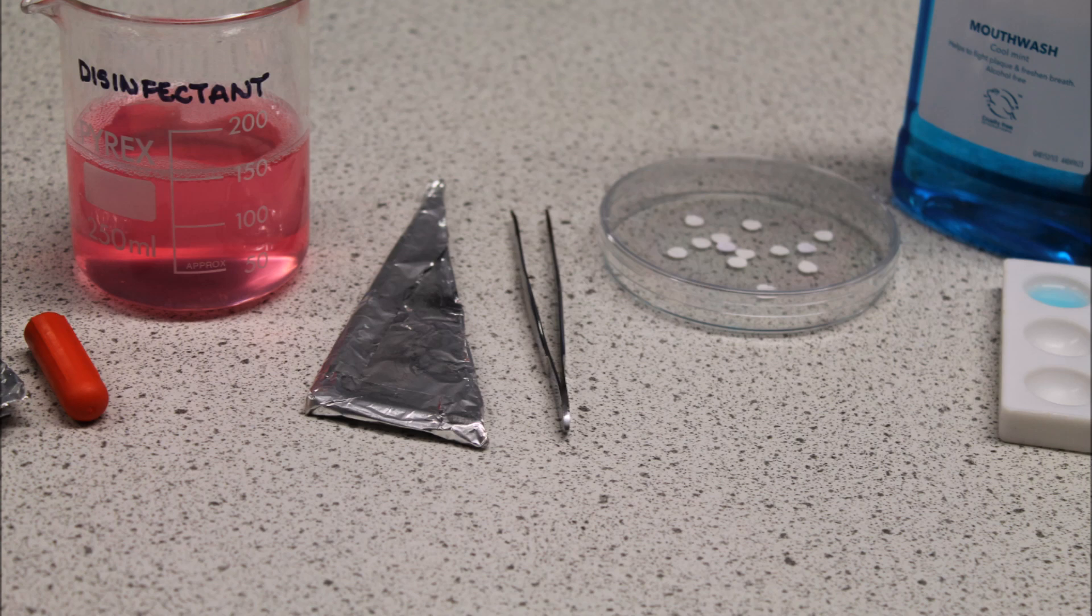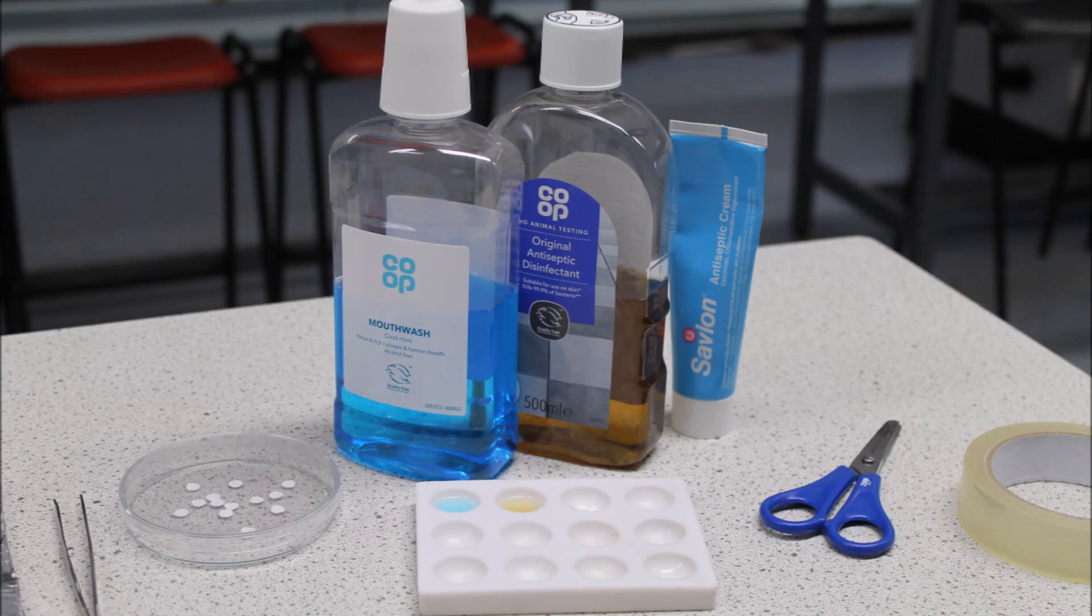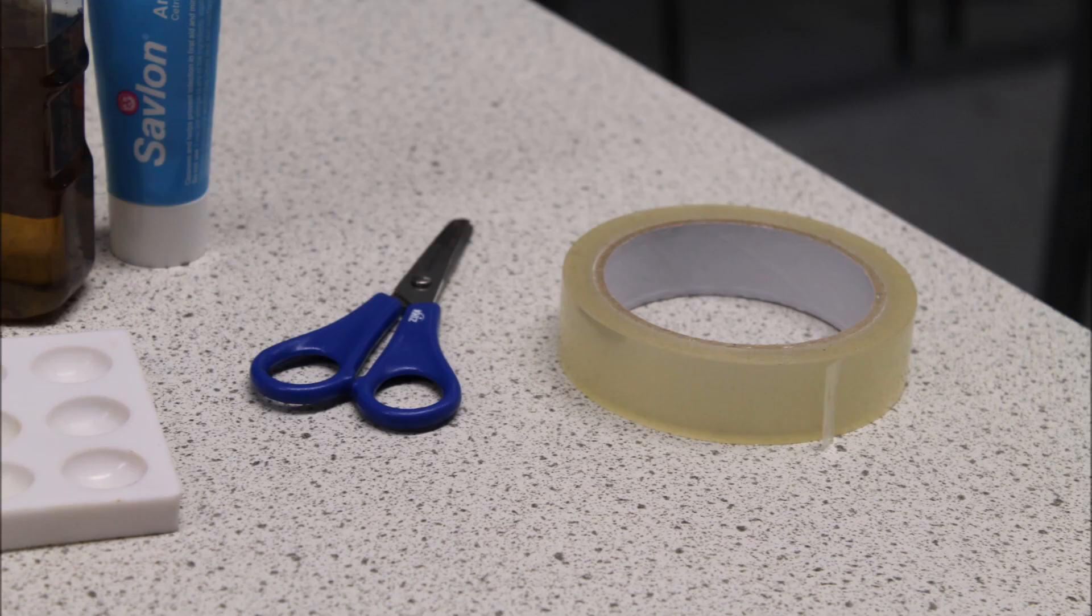A metal forceps. They must be made of metal so they can be held in a Bunsen flame and sterilised. Some small paper discs, three different antiseptics to investigate. Here we have antiseptic mouthwash, liquid and cream. And finally, sellotape and scissors.